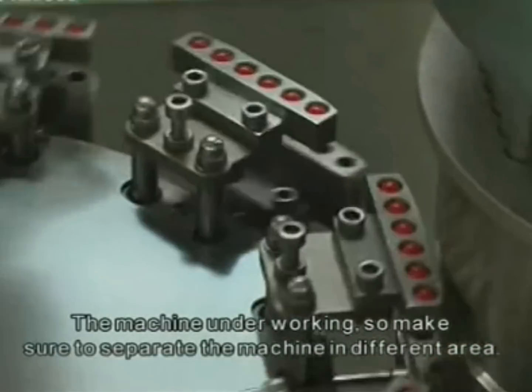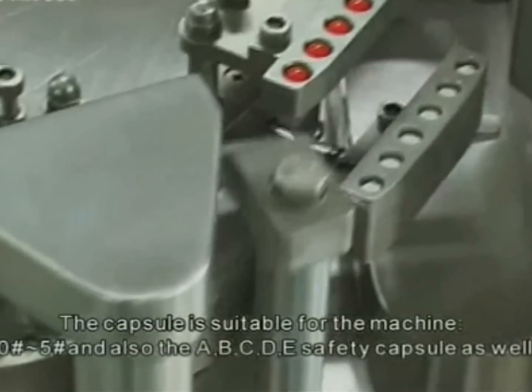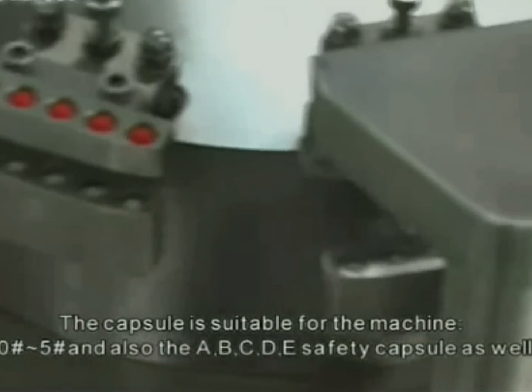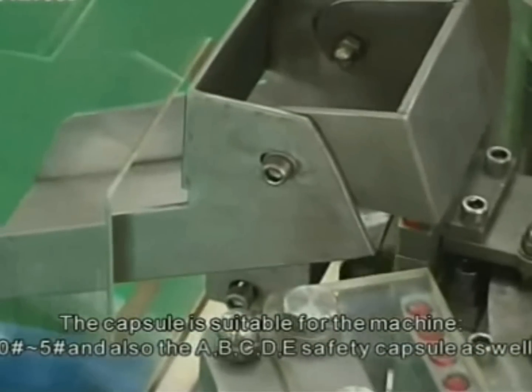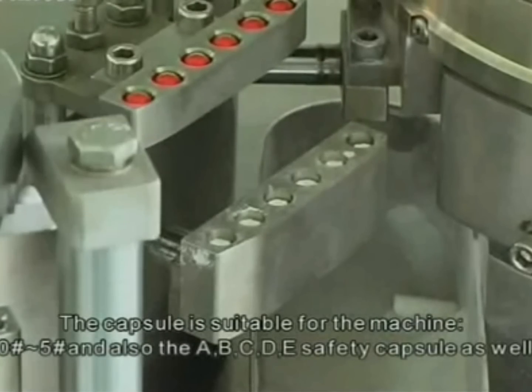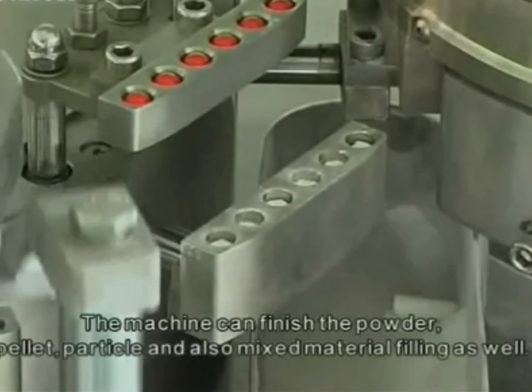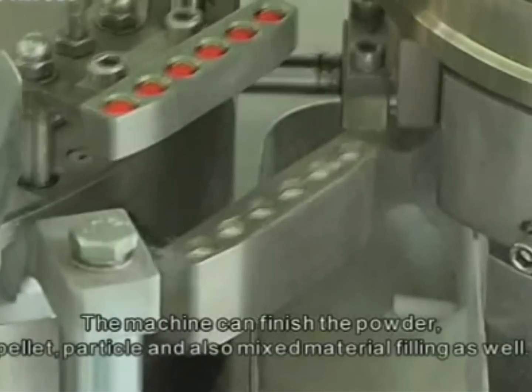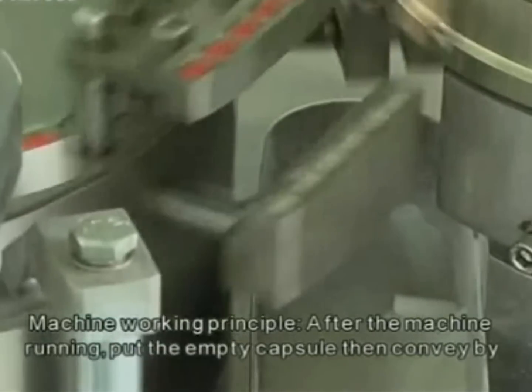Make sure to separate the machines in different areas. The capsule sizes suitable for the machine are size 00 to size 5, and also the A, B, C, D, E safety capsule as well. The machine can finish powder, pellet, particle, and also mixed material filling.